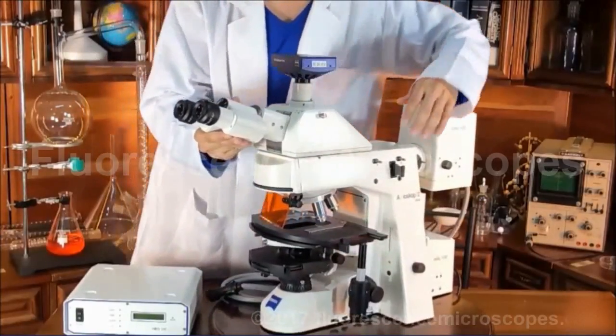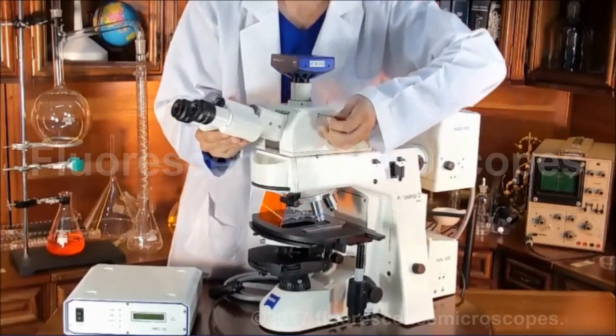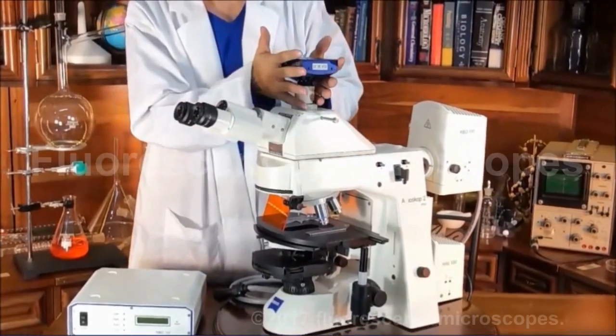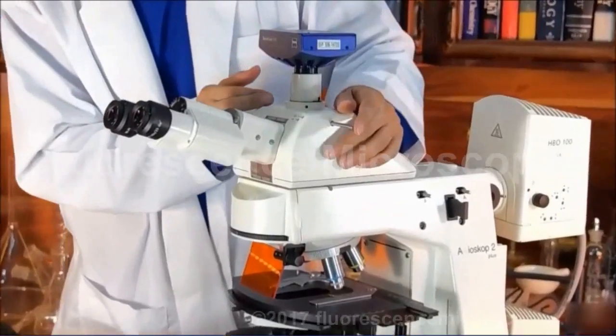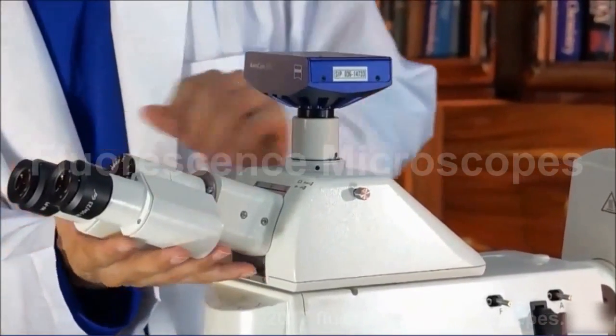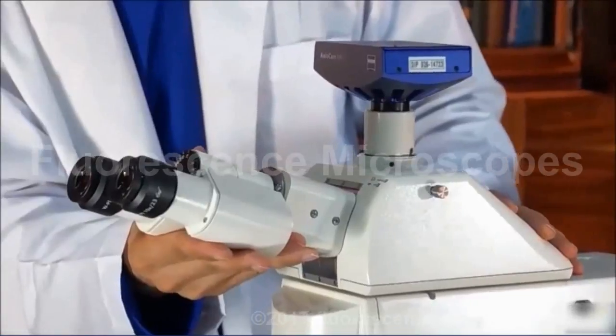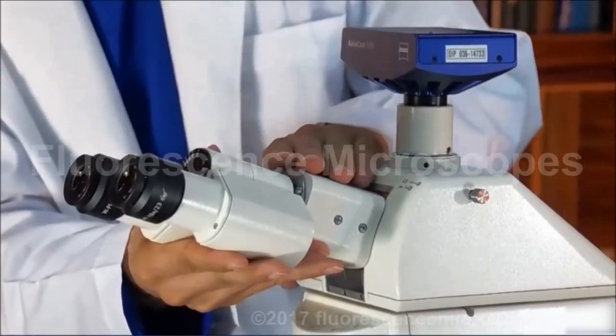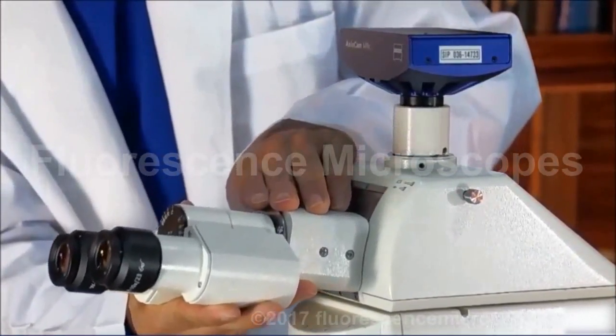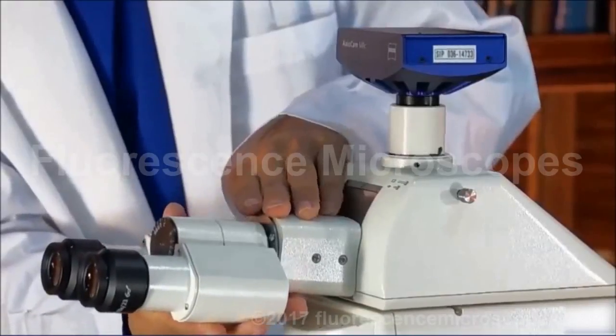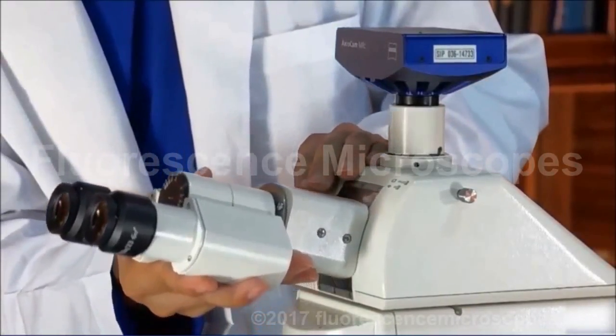Your head is a two position head. You pull it all the way out for one hundred percent light to the camera. You push it in, one hundred percent of the light to the eyepieces. This is an ergonomic head. So if a person is not quite so tall, they may want to adjust this down. If you're a little taller, you're probably going to want this higher.